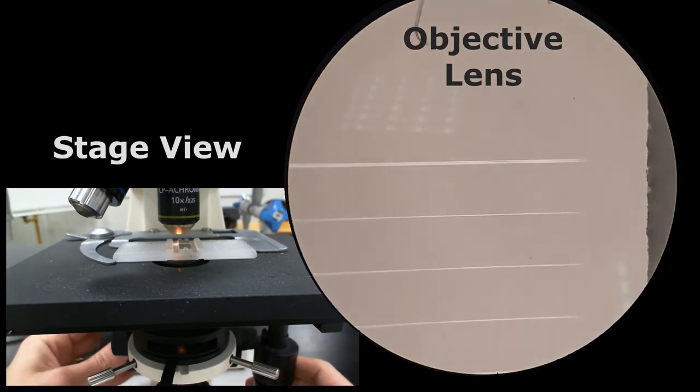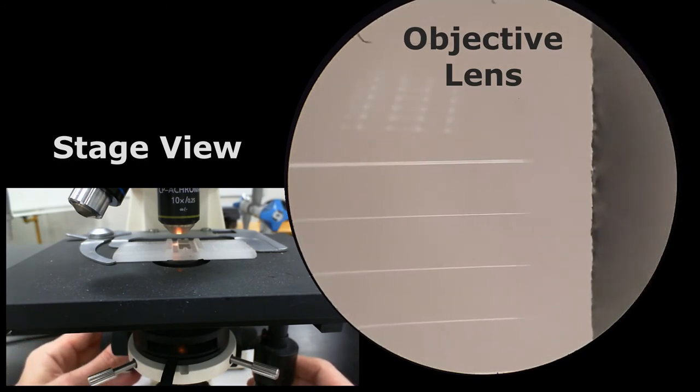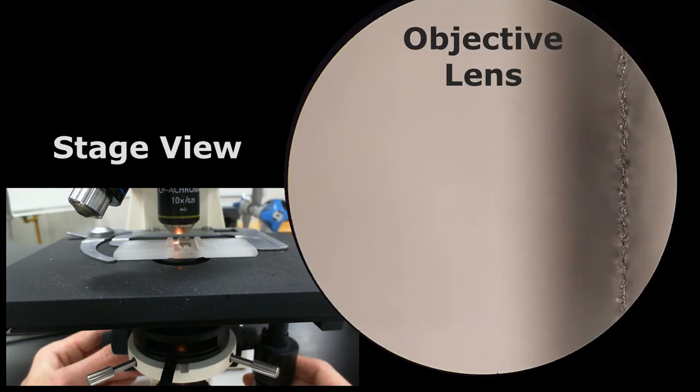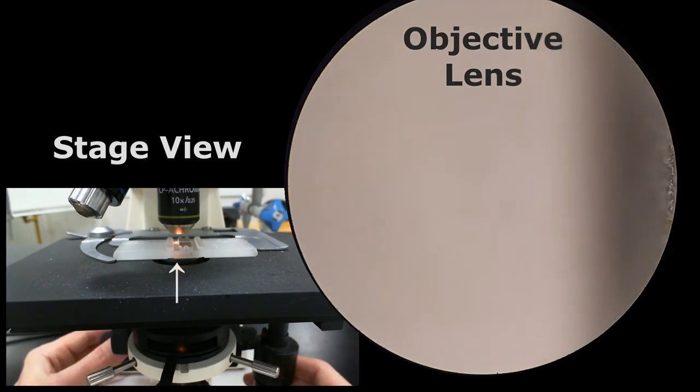There it is. Okay, so now we're focused. I was going to save this tip for later, but that's one thing you can do: try to put one of the trenches close to your field of view. You can see here that right now, under the microscope, I have an edge of the counting area visible.